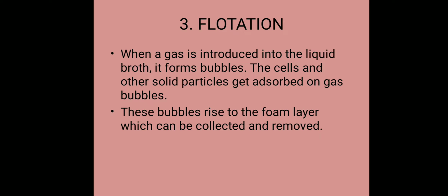The same principle is used in flotation. When a gas is introduced into the liquid broth, it forms bubbles. These bubbles join with the solid particles. The cells and other particles get adsorbed on the gas bubbles, and these bubbles rise up. When they rise up, they are collected.